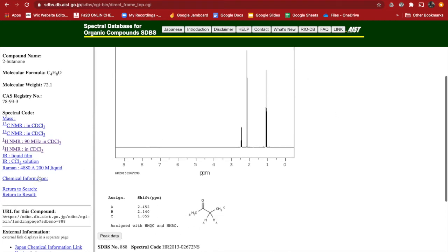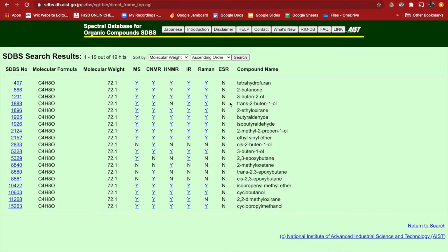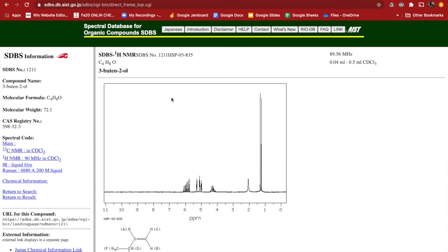All right, so let's return to results is what I want to do. We'll take another one. There we go. Let's try this one, an alkene. So, boom, HNMR. There we go. Ooh, got stuff all over the place on this one.